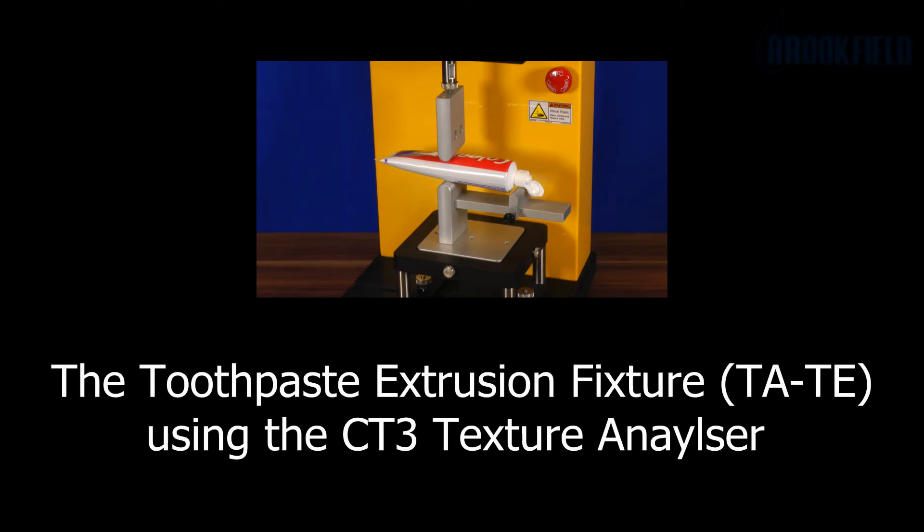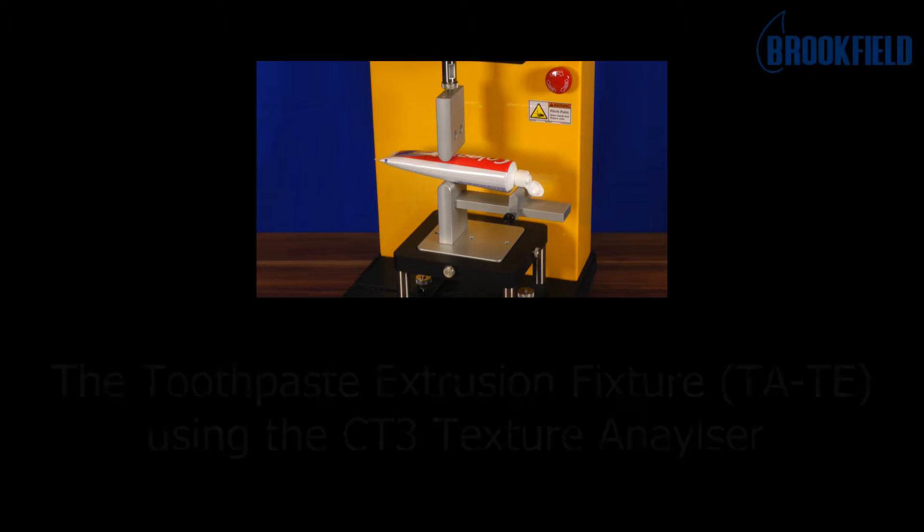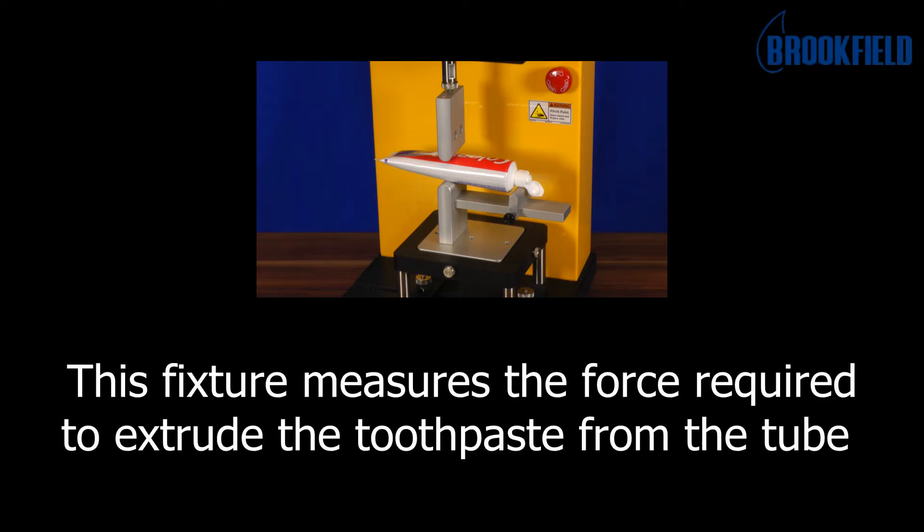This is the toothpaste extrusion fixture using the CT3 texture analyzer. This fixture measures the force required to extrude the toothpaste from the tube.